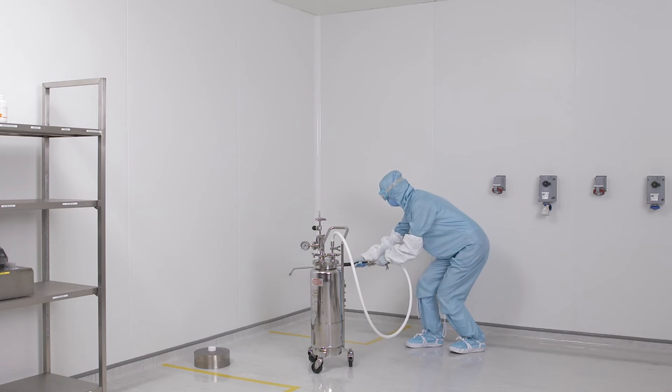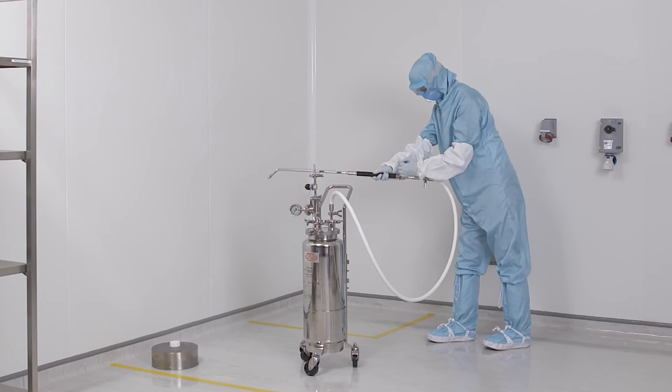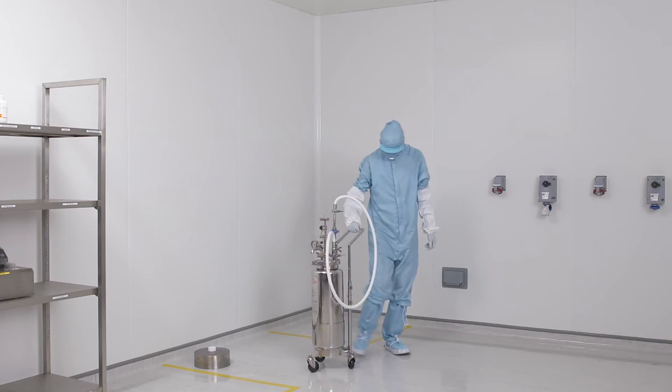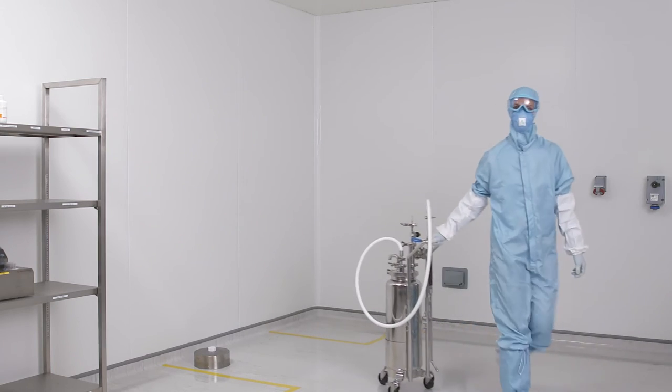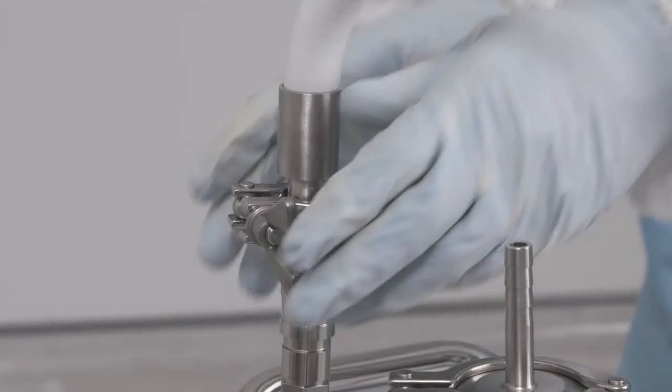The product in it remains sterile and can be used in different rooms, provided the usual transfer disinfection procedures are followed. Practical to sterilize, the system dismantles fully and is designed so that no part is larger than the pressure vessel itself.